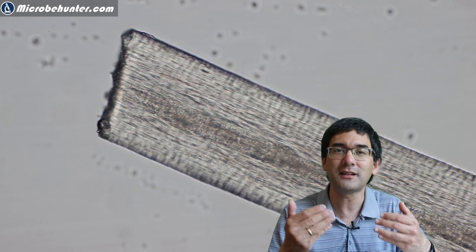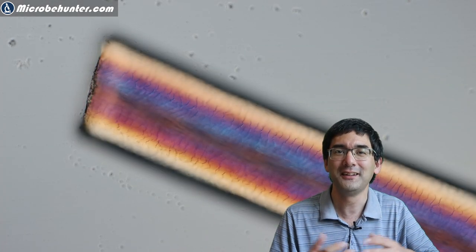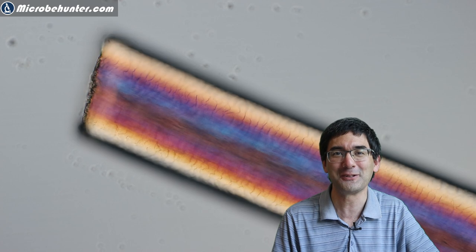But you can see the texture over here already, and if you turn on polarized light, this is when you get the beautiful colors again.